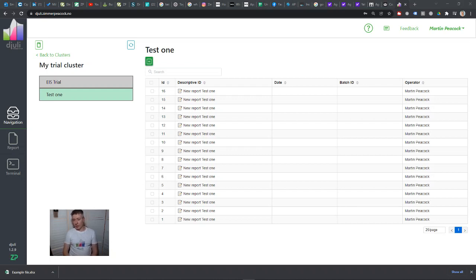Hi, so this is just a quick video to show how Djuli can also be used with Autolab data. Djuli is an online database with much functionality, but in this instance we're talking about how it's tuned to work with electrochemical data. And that electrochemical data could be from the ZP product lines, CH Instruments, PalmSense, Autolab, and probably by the time you're watching this, many others.